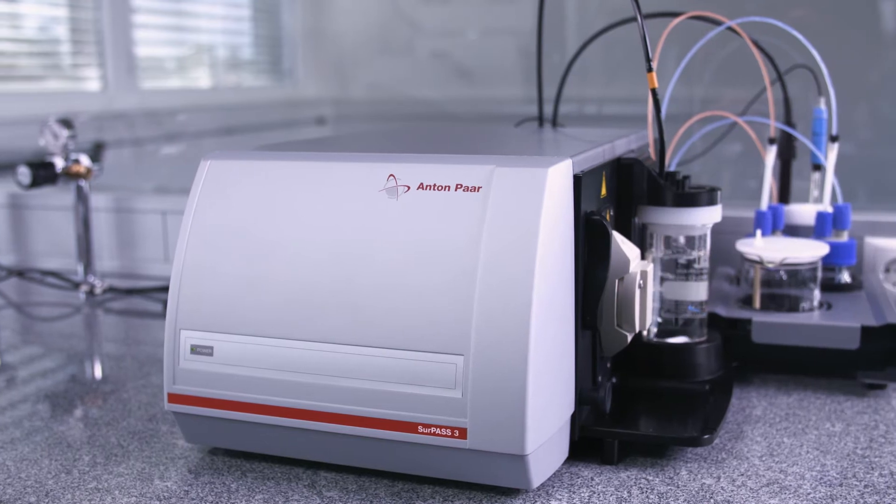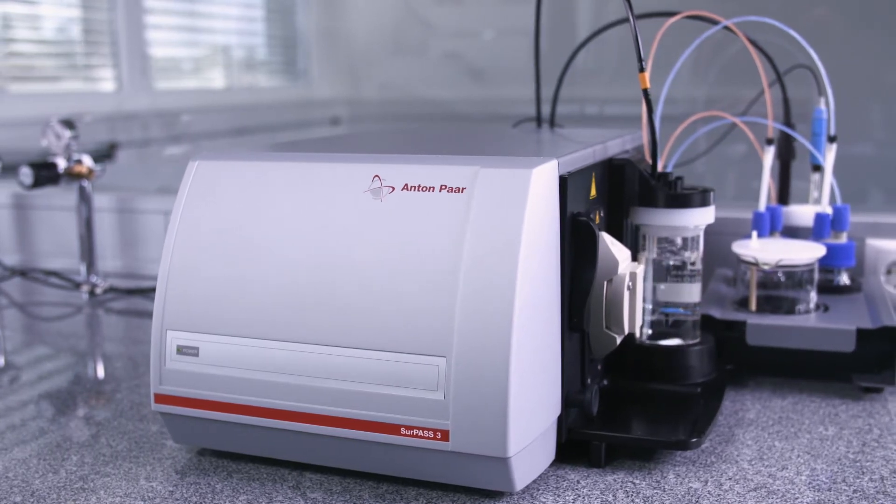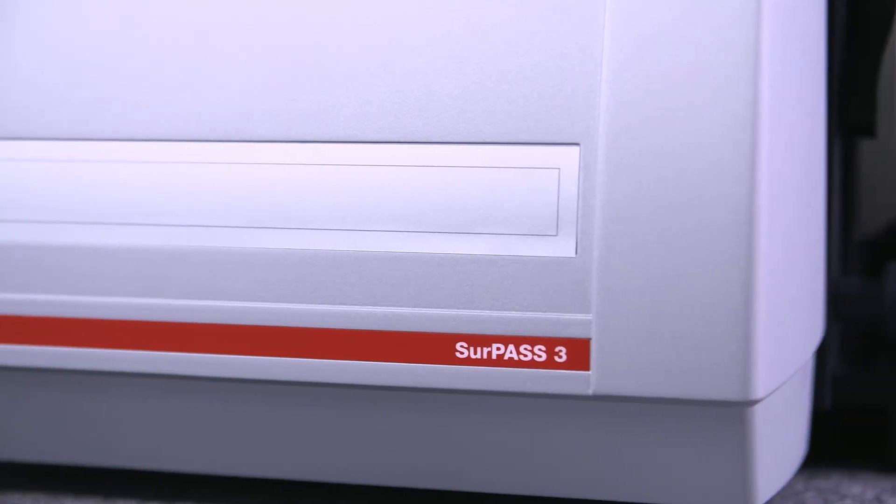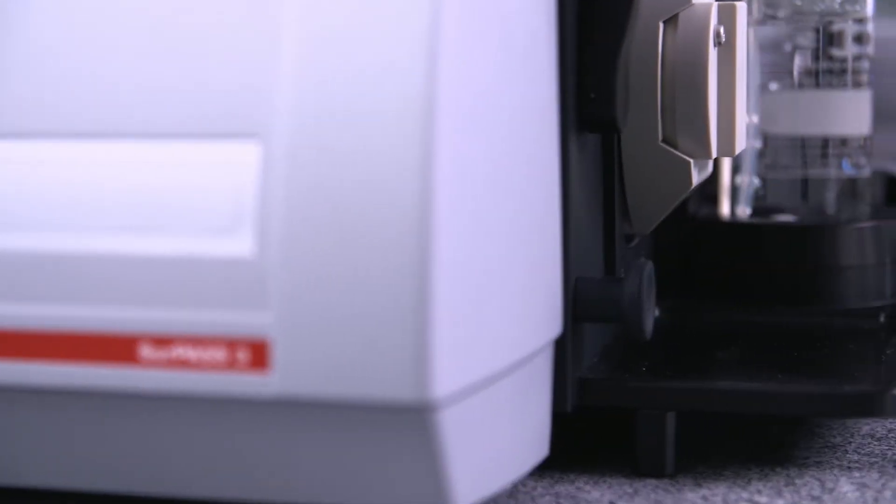Anton Parr's Surpass 3 is a high-end electrokinetic analyzer for solid surfaces that helps you understand and improve surface properties and develop new specialized materials.